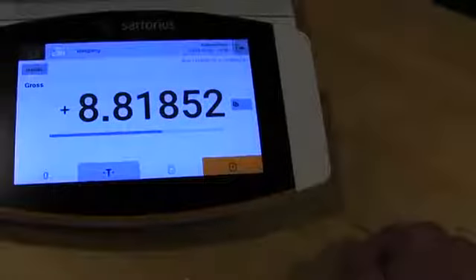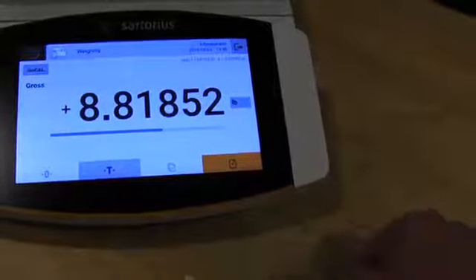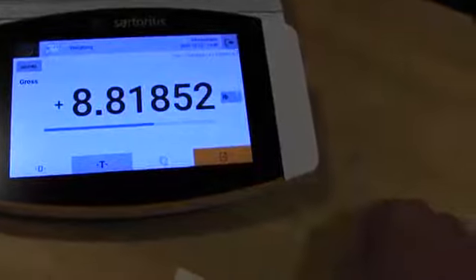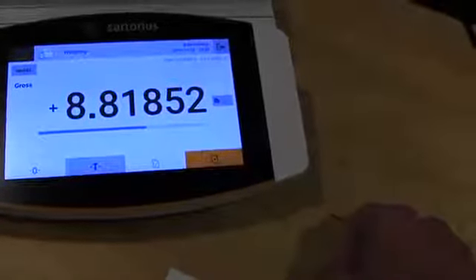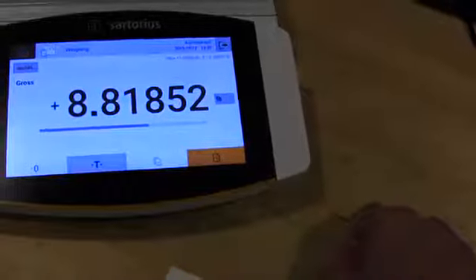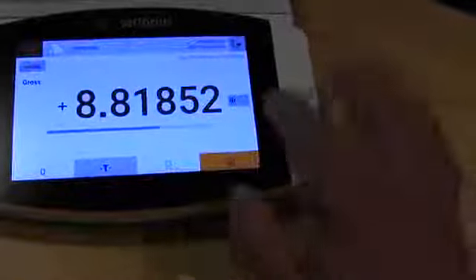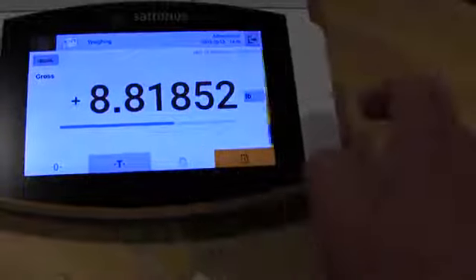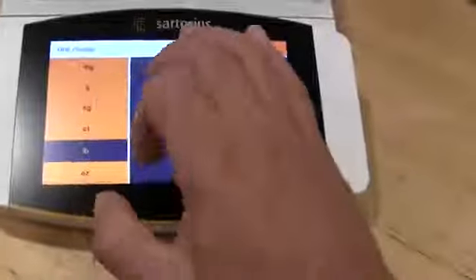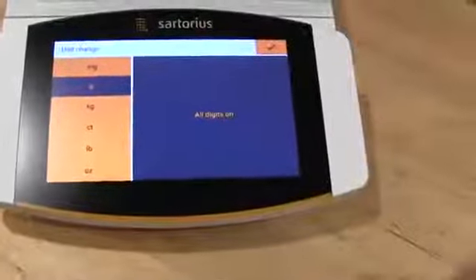So unlike other Sartorius balances, like the old CPA series where you had to go through keypads, this is just all touch screen and it's very simple.